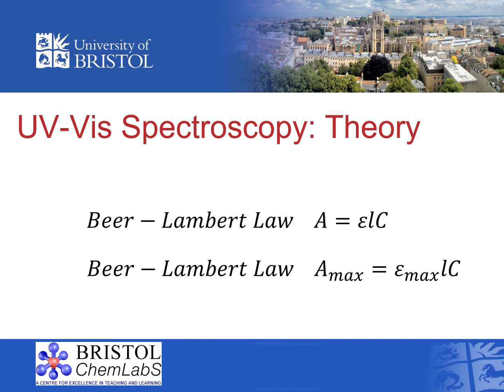The law states that if you double the concentration, then you double the absorbance. This also means that if you halve the concentration, you halve the absorbance. If the wavelength, and therefore the molar attenuation coefficient, and the path length remain constant, then a change in concentration will change the absorbance by a relative amount.